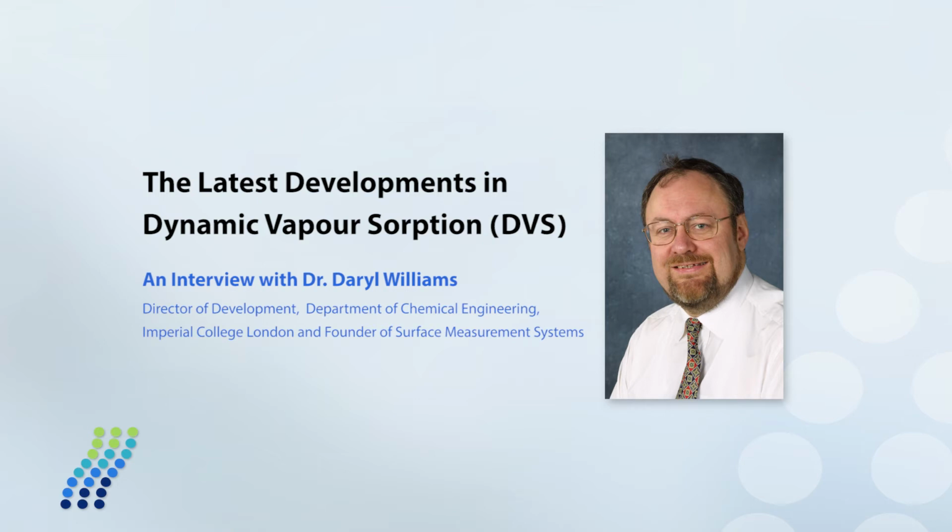We can obtain information about the surface of a material, such as the surface area. We can obtain information about the porosity, such as the pore size distribution. And we can also find information about the solubility, the way in which water dissolves inside a solid state material. Those three classes of information sets are often unique to the DVS method, making it a very powerful research method.